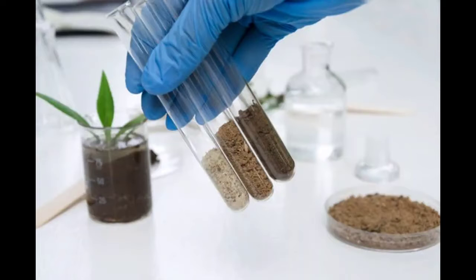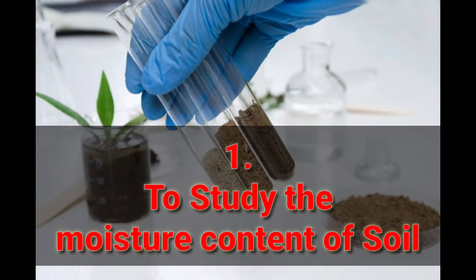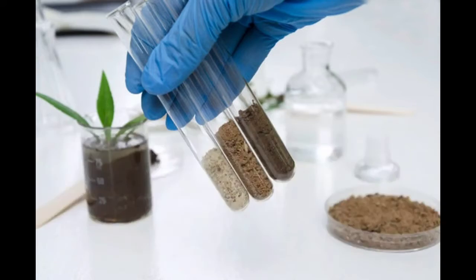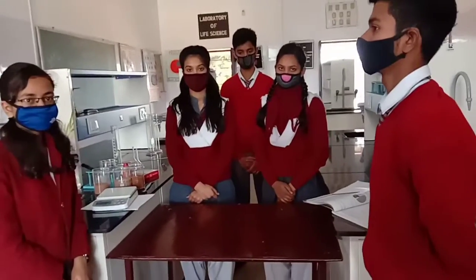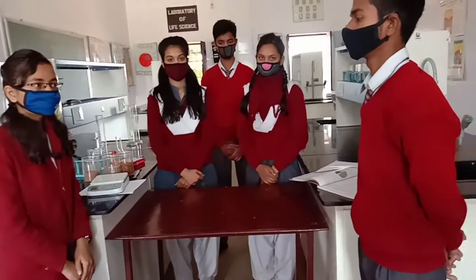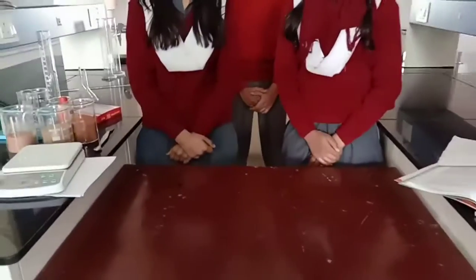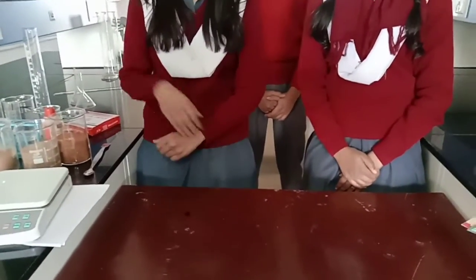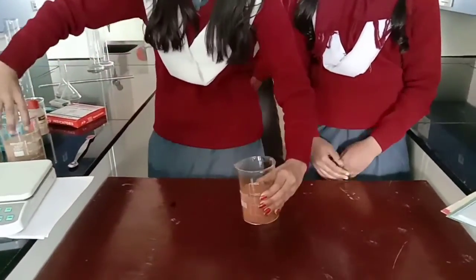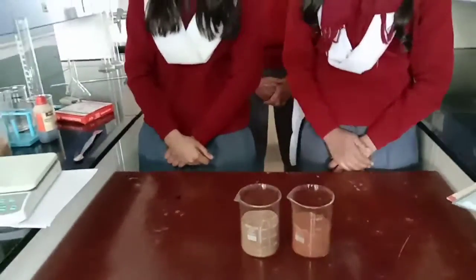Finally, we are left with the last experiment of our today's practical class. Aim: to estimate or to study the moisture content of the soil samples. Principle of the experiment: the moisture content of the soil is described as the ratio of the mass of water held in the soil to the dry soil. The mass of water is determined by the difference before and after drying the soil.